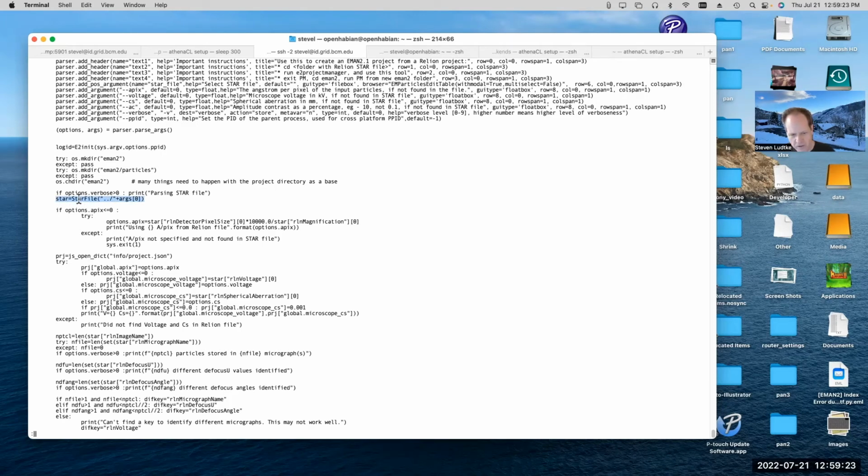So basically, you just say star equals star file. So you open the file, and then once you do that, it basically gives you dictionary access to any of the columns that are present in the file. So you say star of Relion type, it omits the initial underscore, but other than that, you just access it like a dictionary, and it'll give you a list which contains all of the values for that particular column of the file.